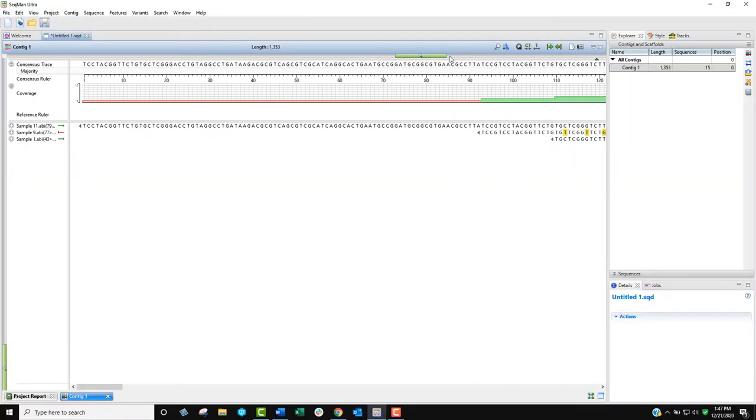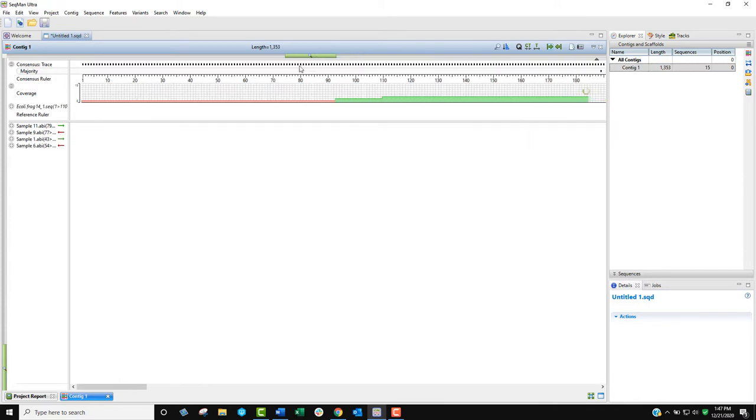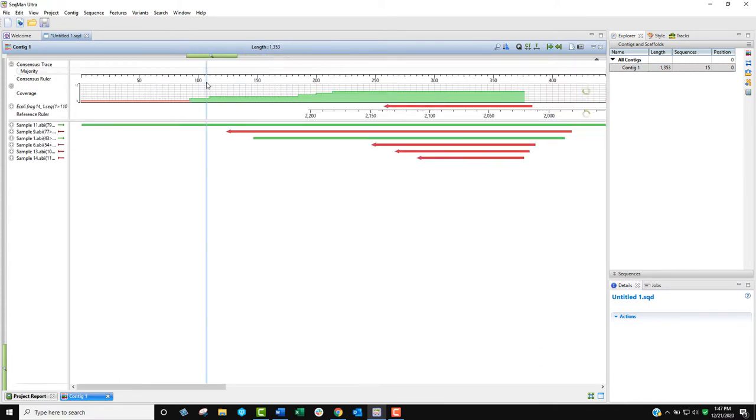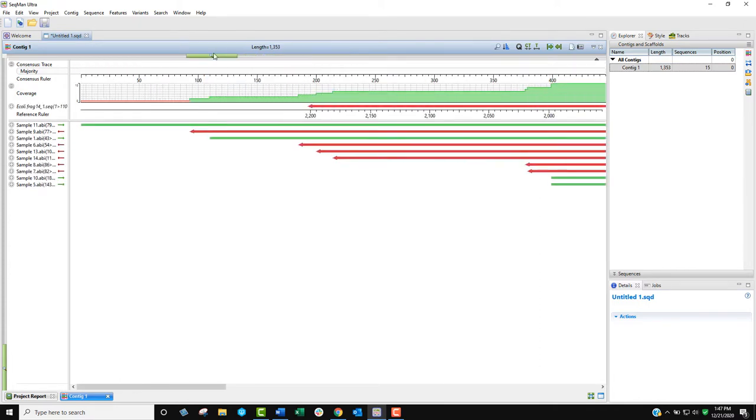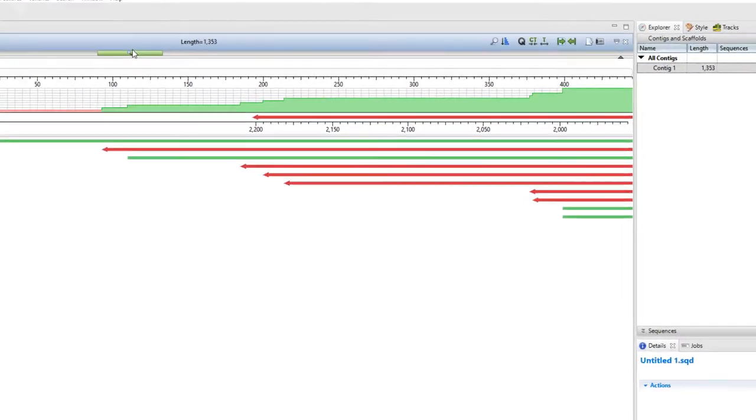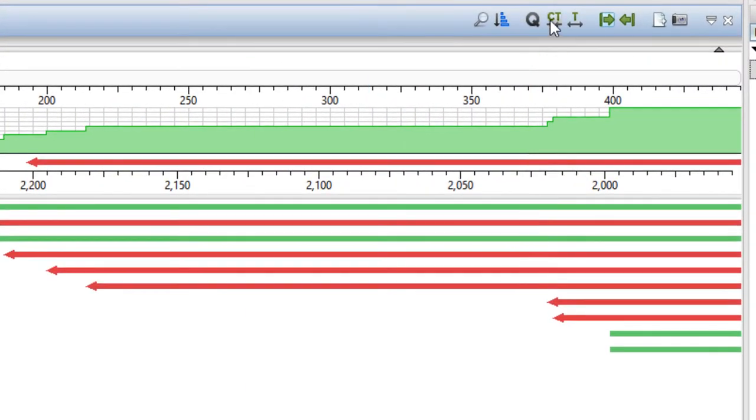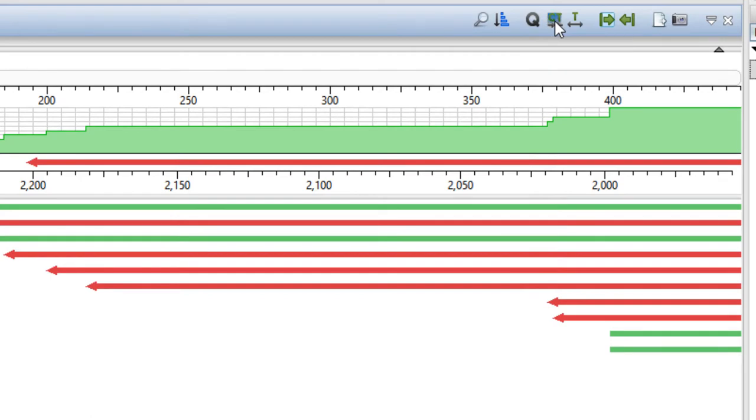To zoom in and out, use the green zoom slider. To return to default zoom settings, use the CT or T tools for more compact or less compact displays.